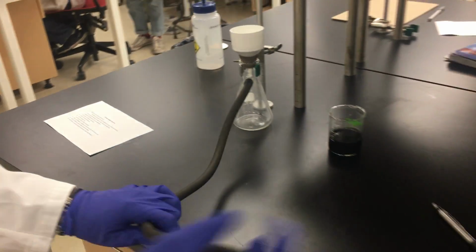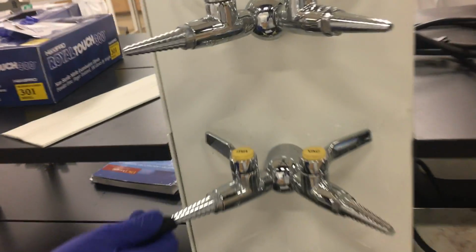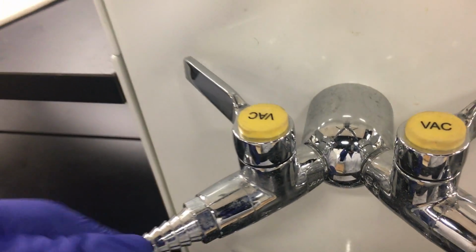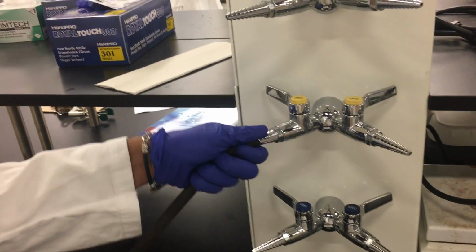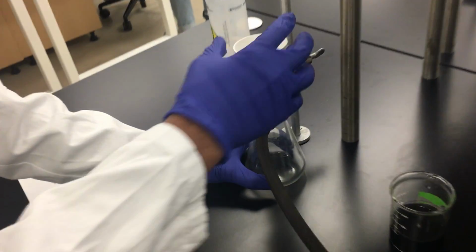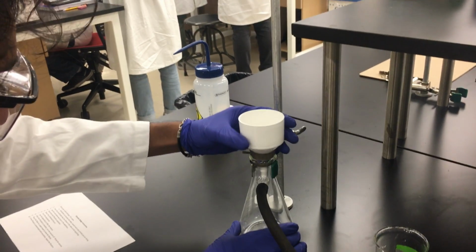We're going to take the other end of the pipe, and we're going to attach it to the middle pipe, which is labeled vacuum. Now this ensures that there's a vacuum suction from here through the pipe to the flask, and the only way out is up. There we go.